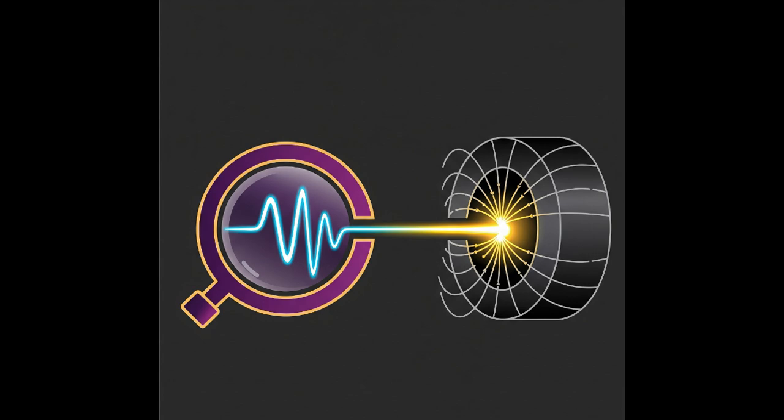And finally, that charged nature also gives us incredible control, just like the old cathode ray tube televisions. Remember those, where an electron beam was scanned across the screen to create an image? We can precisely scan an electron beam back and forth across our sample. This scanning capability is what allows techniques like scanning electron microscopy, giving us detailed surface topography that light microscopes just can't provide.